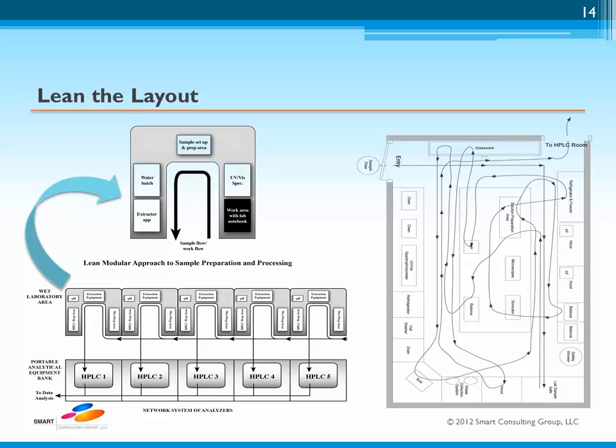However, being part of an integrated value stream for the overall process, the cadence of the laboratory function is best set to match the needs of the slowest point in the process, since moving any quicker will not add to the best outcome of the value stream. Heijunka devices, through their repeating sequence process, eliminate the need for customized planning tools by devising a process that can accommodate a mix of sample types. Even a buffer sequence can be introduced in a tool to prevent some functional variability without disrupting the balanced level flow of the routine sequence of the analysis.